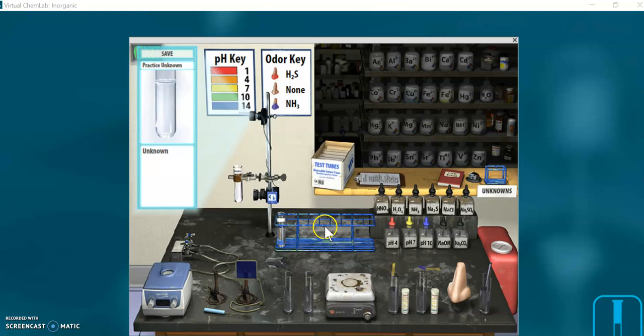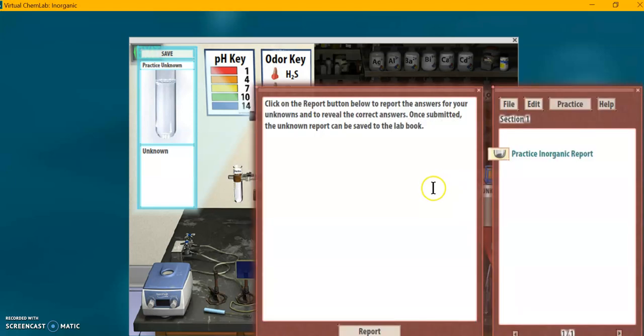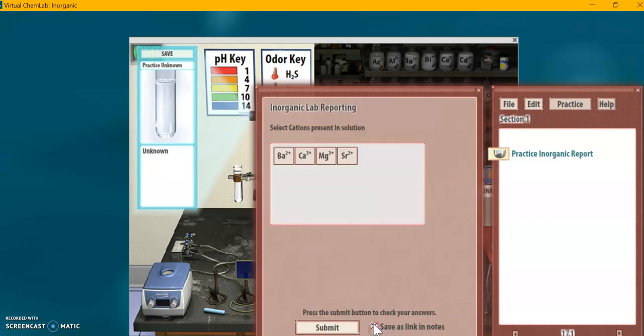When you're done with your qualitative tests, check your results. On the worksheet, it says to click the lab book. And on the left page, click the report button right down there. And we have some options here.